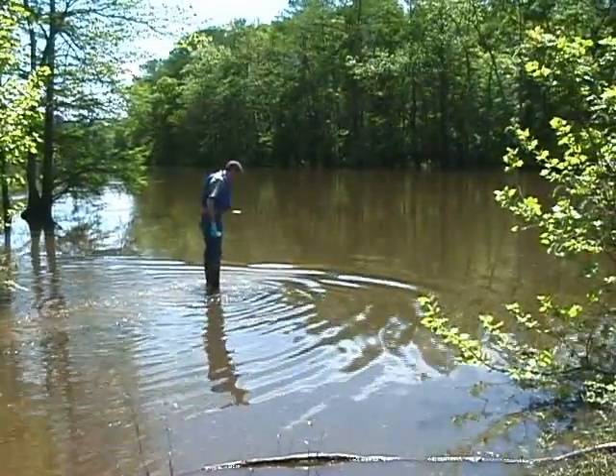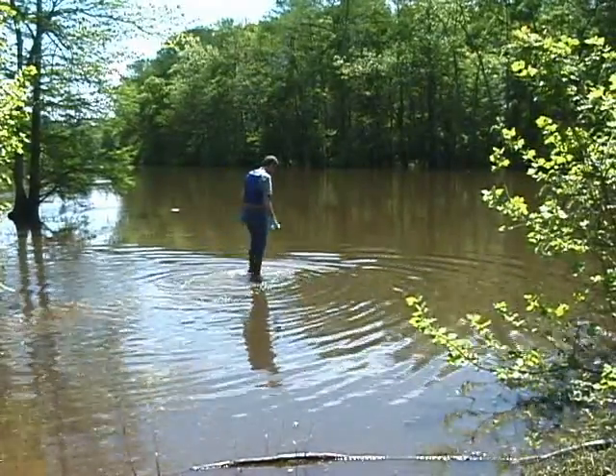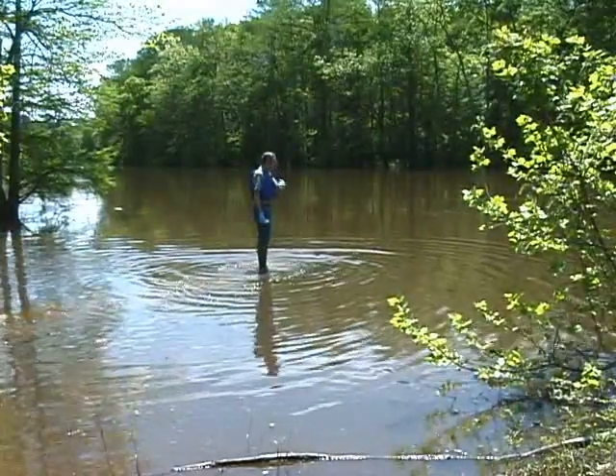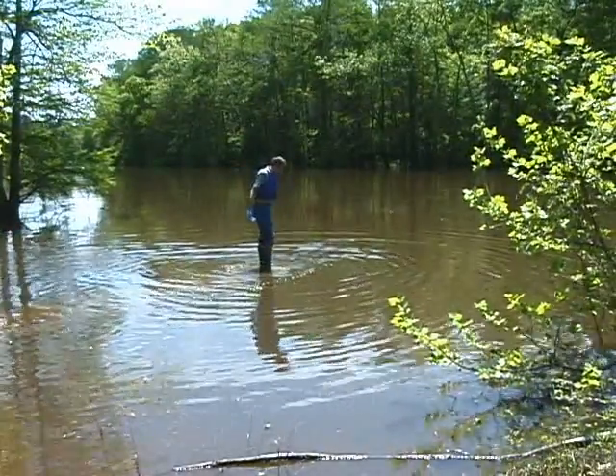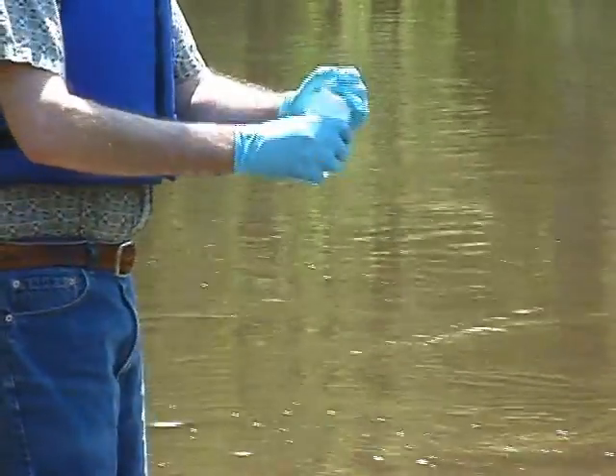Take the sampling bottle out of the outer bag of the river kit. Find a spot in the river where you've got water flowing past you and simply take off the cap.